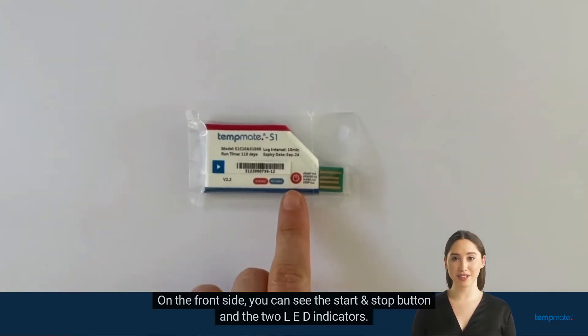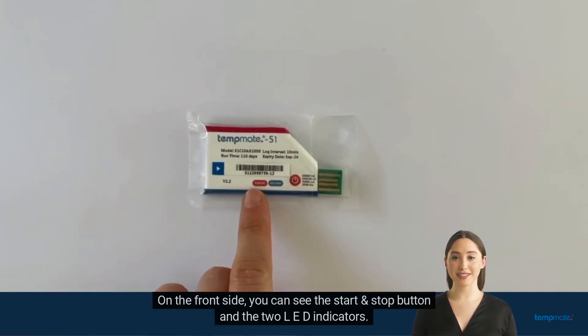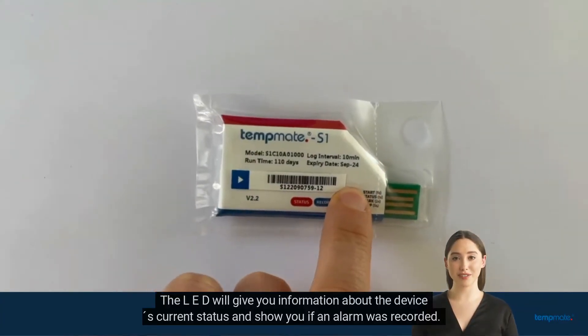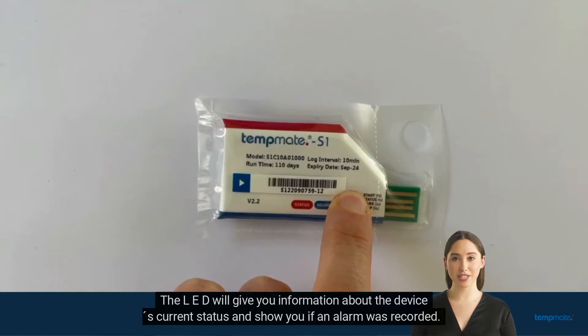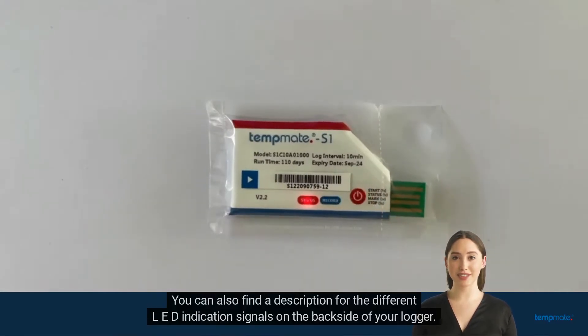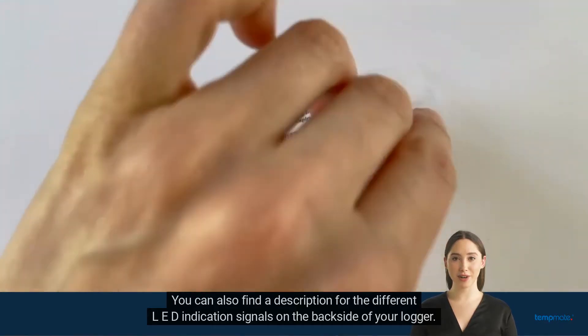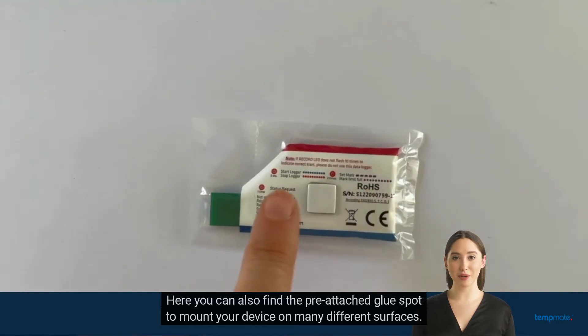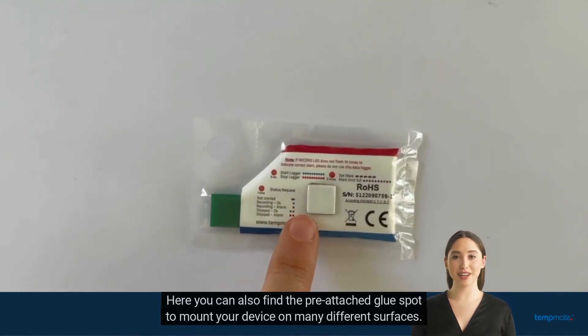On the front side, you can see the start and stop button and the two LED indicators. The LED will give you information about the device's current status and show you if an alarm was recorded. You can also find a description for the different LED indication signals on the back side of your logger. Here you can also find the pre-attached glue spot to mount your device on many different surfaces.